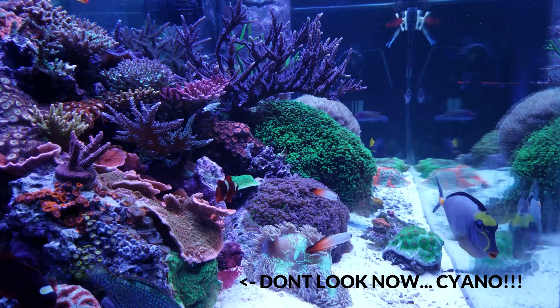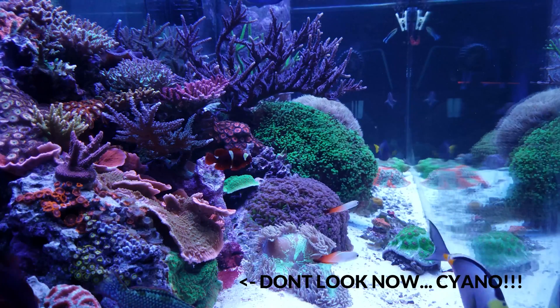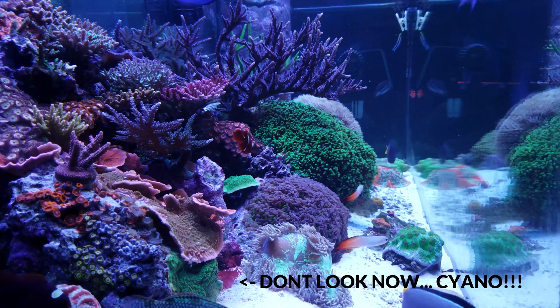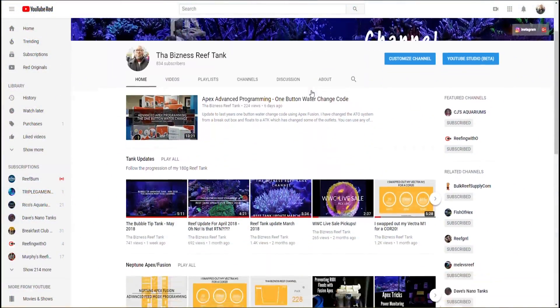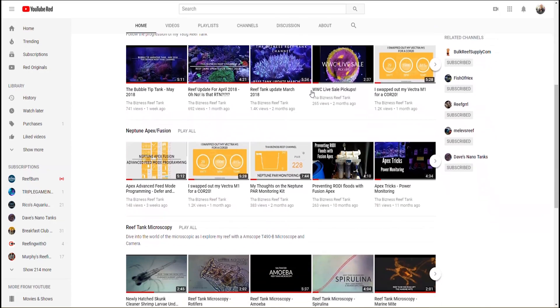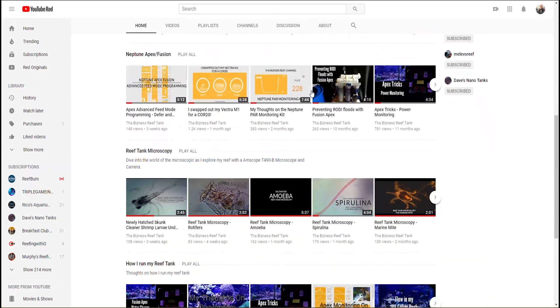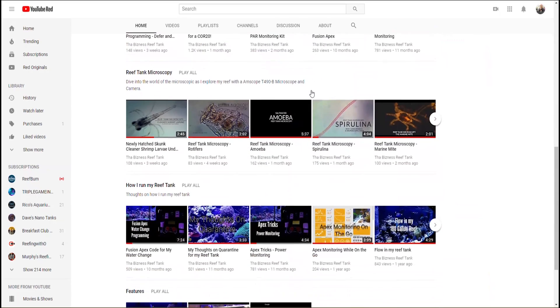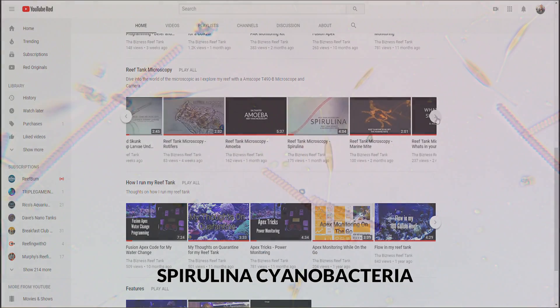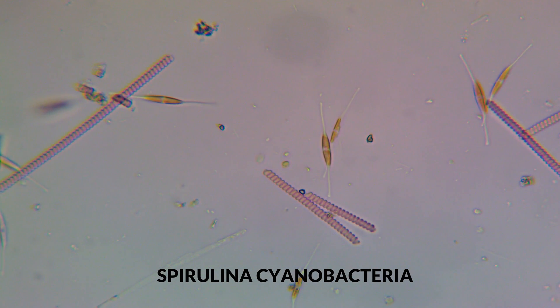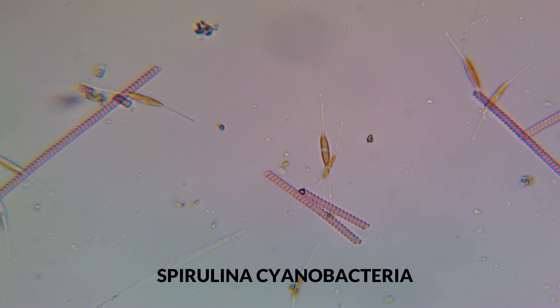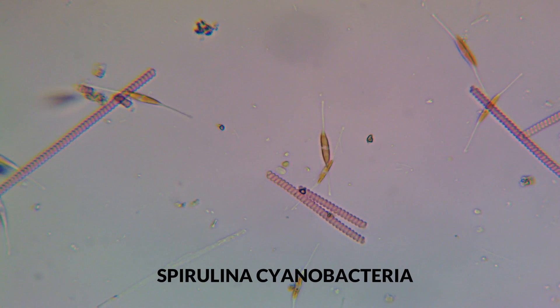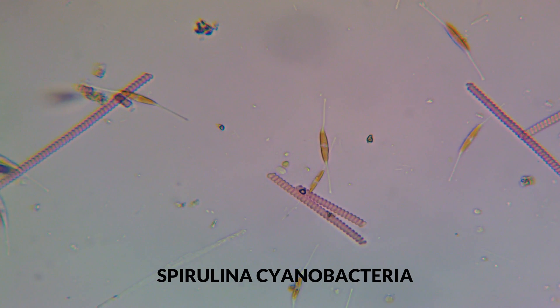If you follow the Reef Tank microscopy videos, you know that I've already released a video on cyano. In one of my last videos, I showed you images under the microscope of spirulina, which is a form of cyanobacteria. Now, cyanobacteria is also called blue-green algae, but it's really not an algae at all — it is a bacteria.